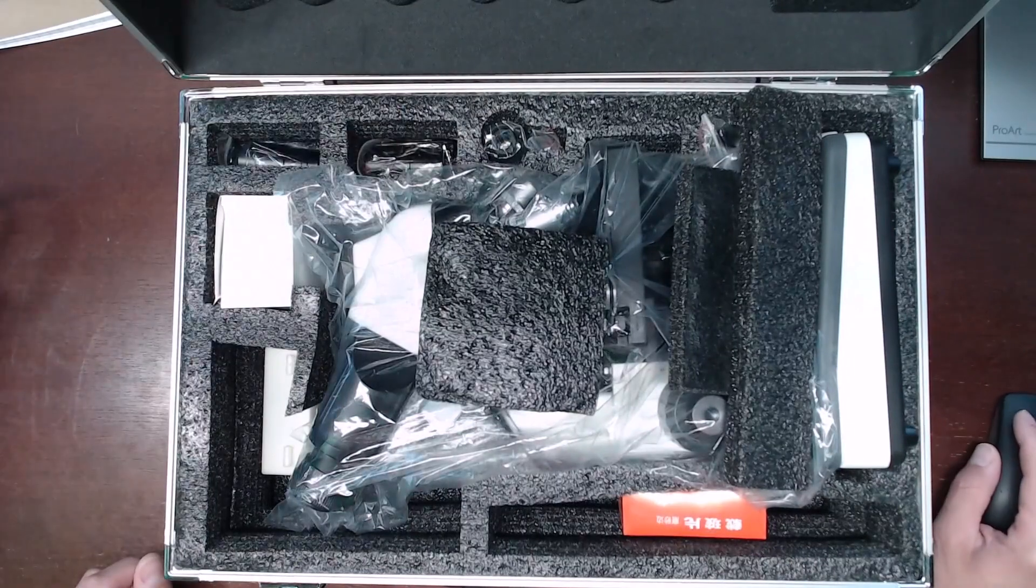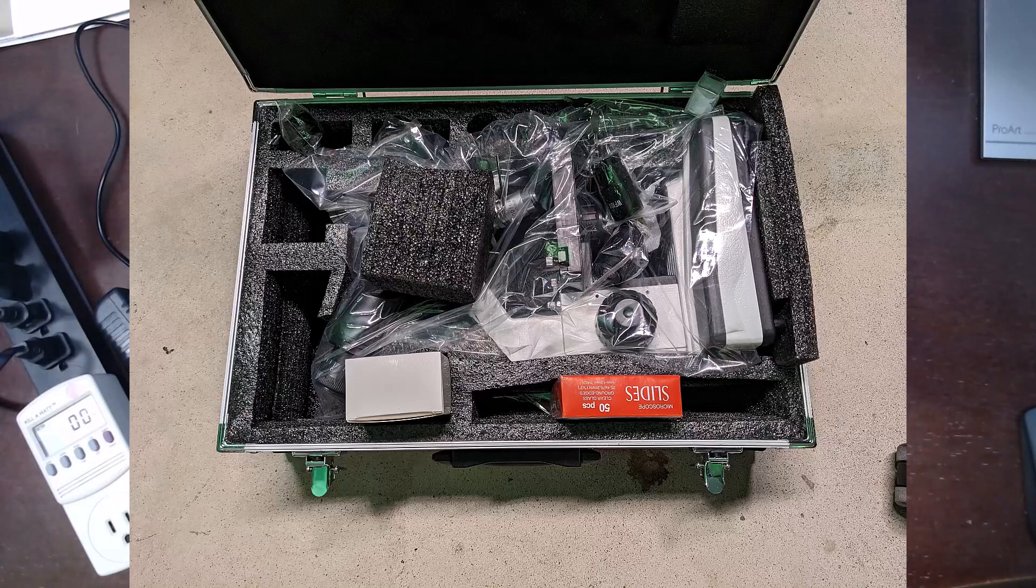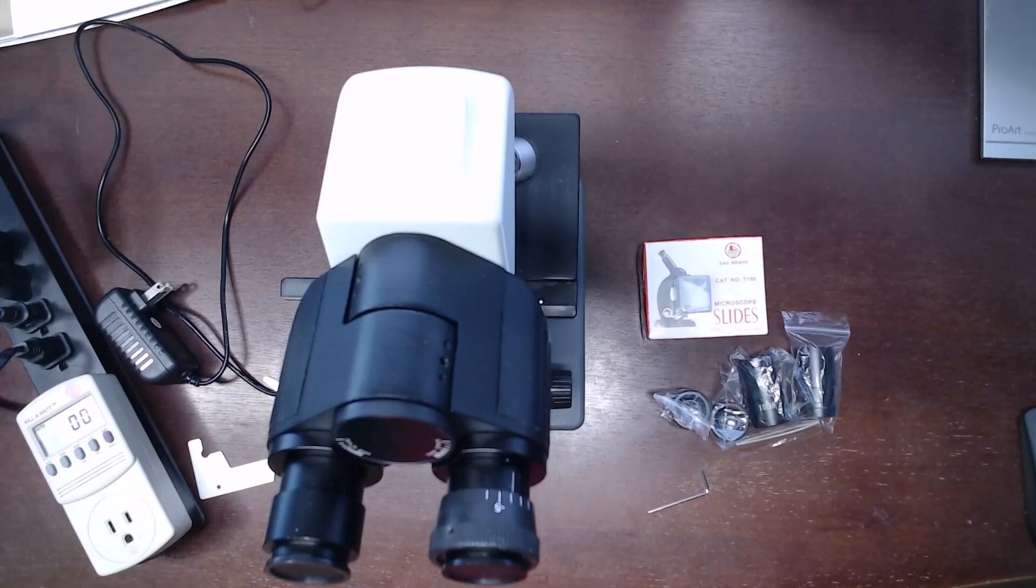While there are plenty of sectioned off spaces in the case for all the parts, things do move around quite a bit, and that gives me some pause if this will be a problem if you pack and unpack regularly.